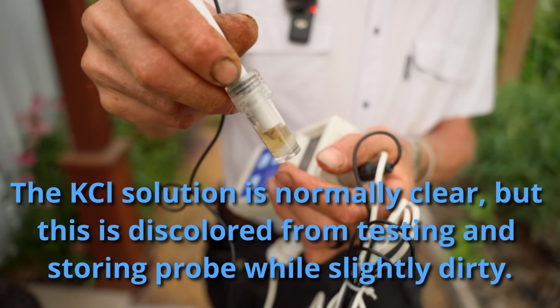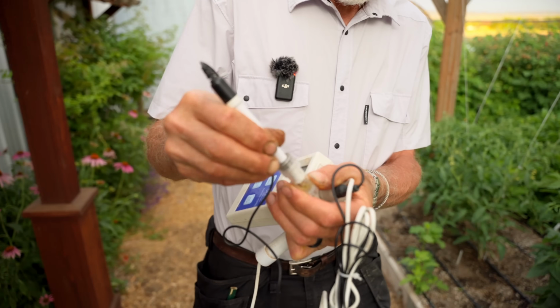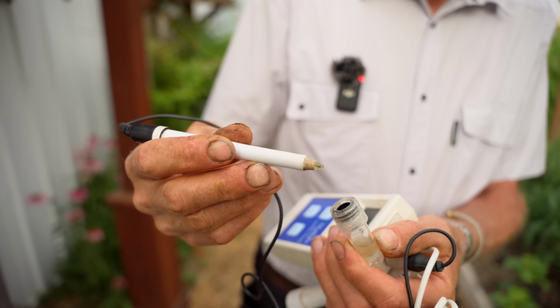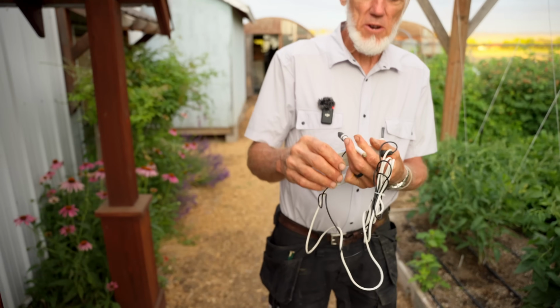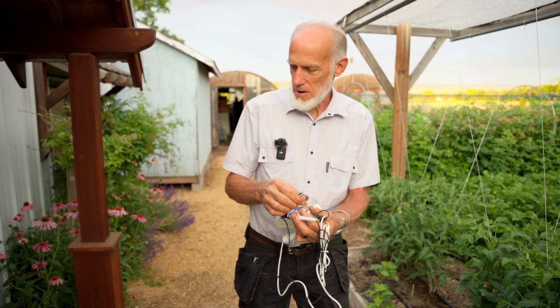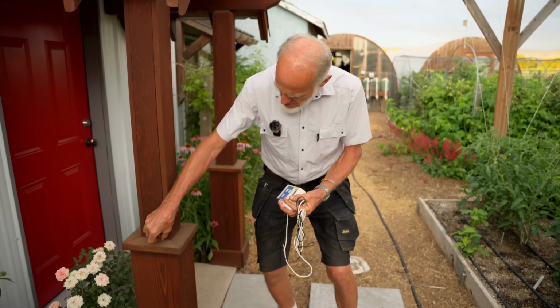Yeah, it's to protect the tip. What's in that fluid, Luke? It's a potassium chloride. It's not a nutrient grade, but it's a lab grade. And so what it does is it preserves the tip from drying out and the ion relation in there. Okay, so that's what it's for. You have to store it in there. Yeah, it needs to be stored in that. So you can't just leave it sit out on your counter dry like this. You're right. It won't work. It'll damage the measurement probe over time.